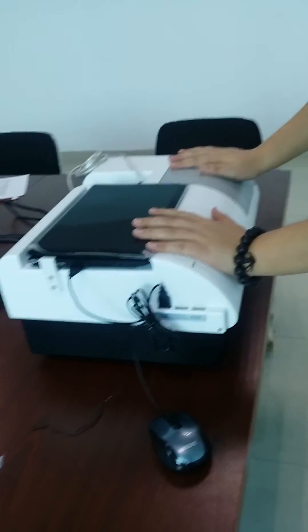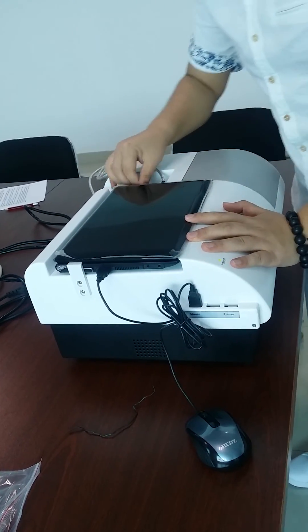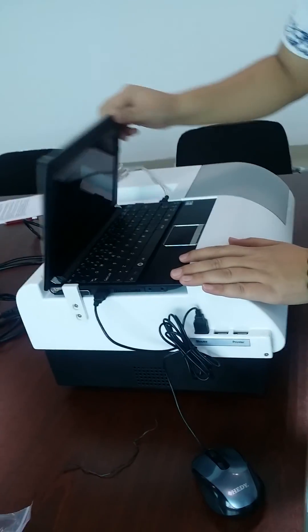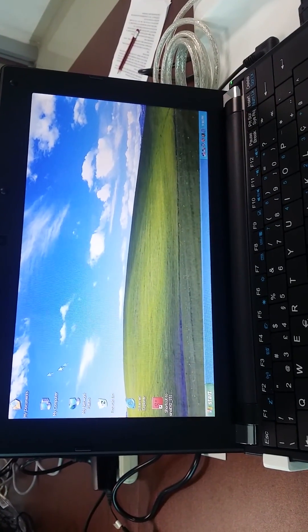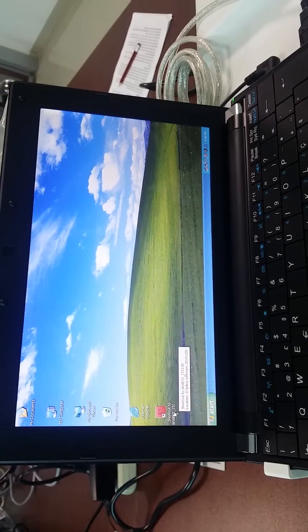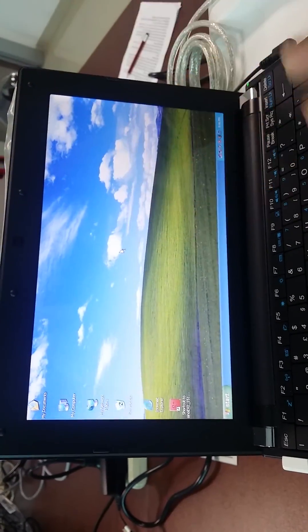After you finish this, please make sure every connection is OK. Check again that the power is connected to the computer. After we turn on the computer, you will check that the software is present. If you cannot find it, please let us know and we will send the software to you. If the interface is OK, we should turn on the power of the machine.